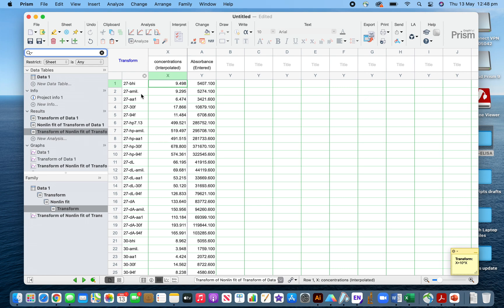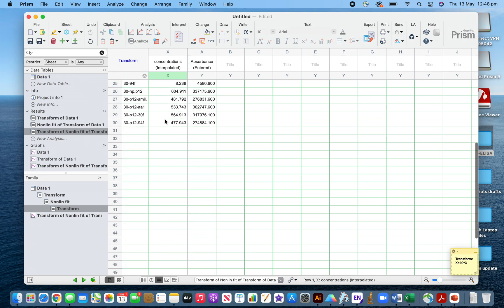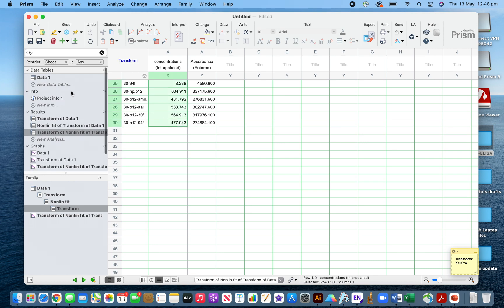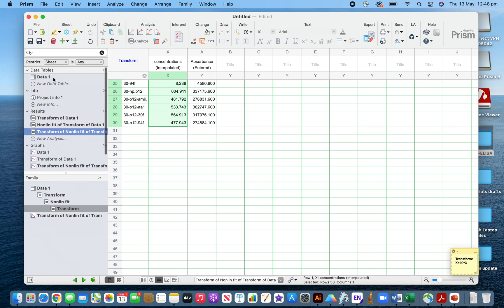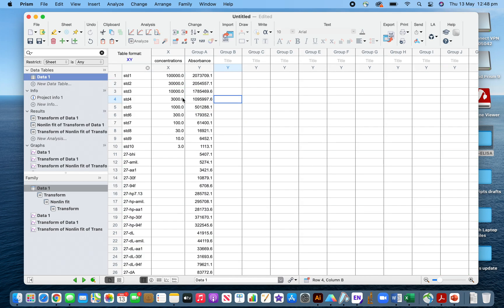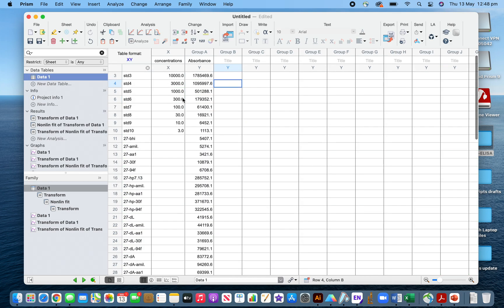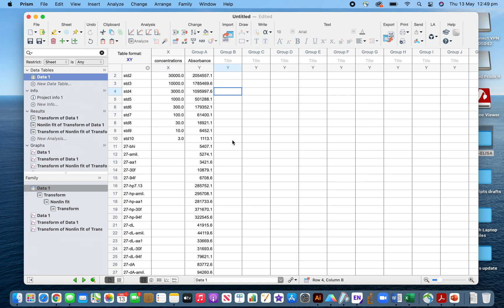Now what you have to do is copy this and then paste to the original dataset here, because you want to know the samples.